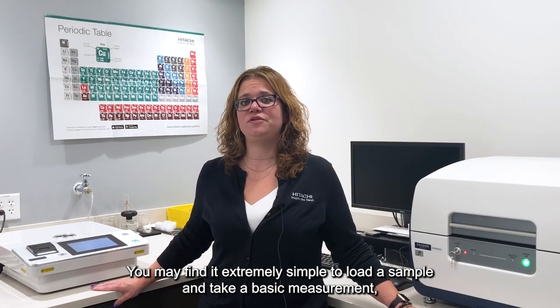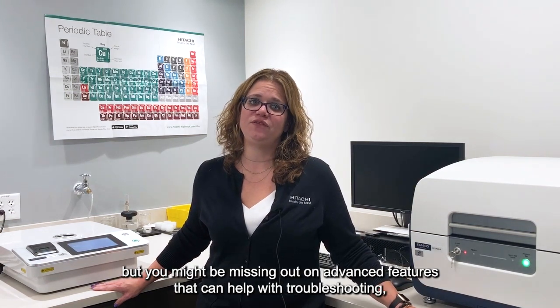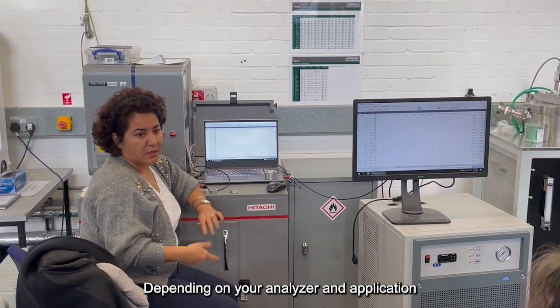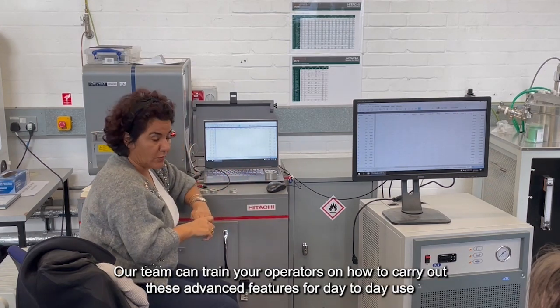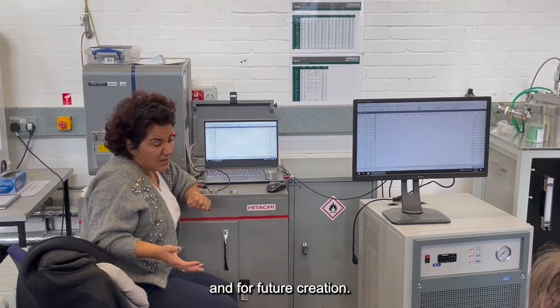You may find it extremely simple to load a sample and take a basic measurement, but you might be missing out on advanced features that can help with troubleshooting, process control, and maintaining quality. Depending on your analyzer and application, we can help you determine which features may be the best fit for your needs. Our team can train your operators on how to carry out these advanced features for day-to-day use and for future creation.